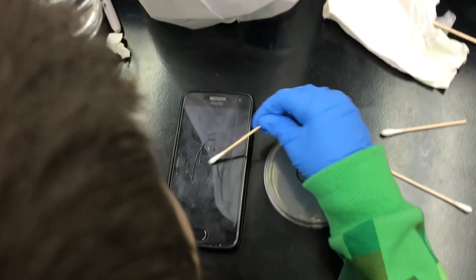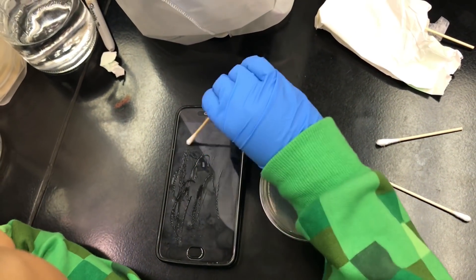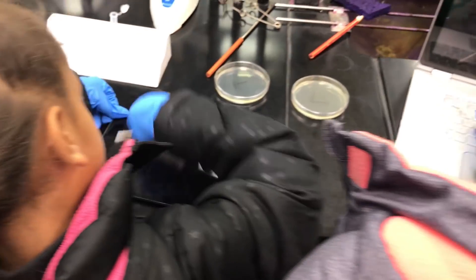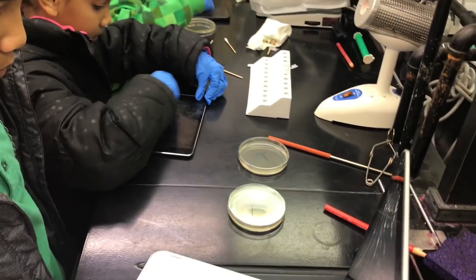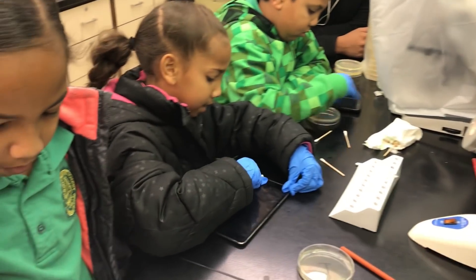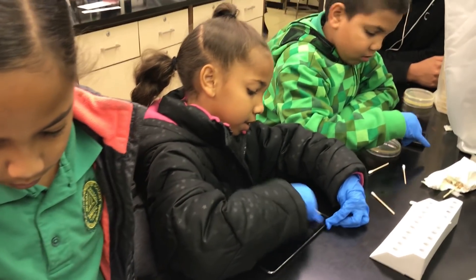Get it all over it, all in the grooves. Twirl it around to make sure all sides of the swab make contact. Even do the button. Do the flat part.